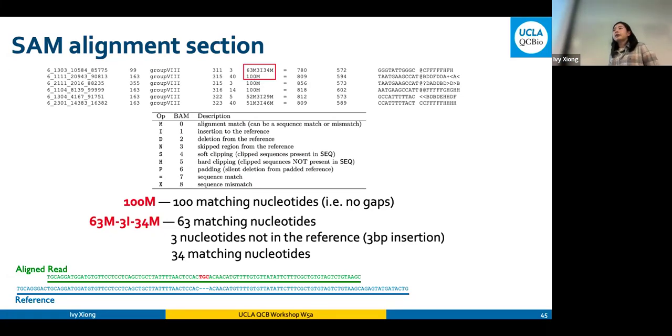But for mRNA, I think it's relatively less of a concern. Yeah, for today, rest assured that it doesn't really affect us much. But just bear in mind that when you align something to a reference genome, that comes with a lot of variations of potential insertion, deletion, even structural changes sometimes. In tumor samples, which is very common, you have part of chromosome 1 get inserted into chromosome 3, and then losing a whole chunk of, anyway.